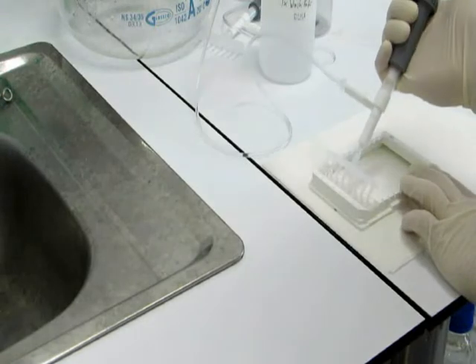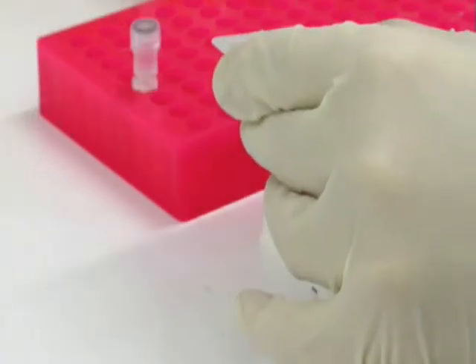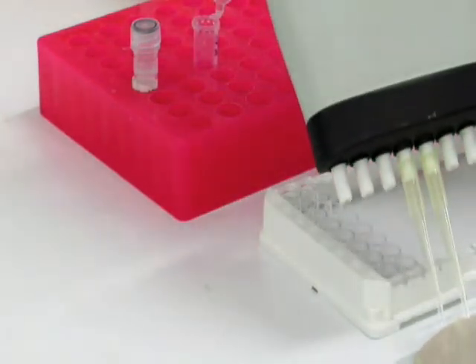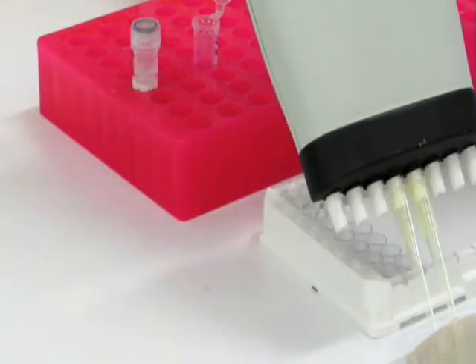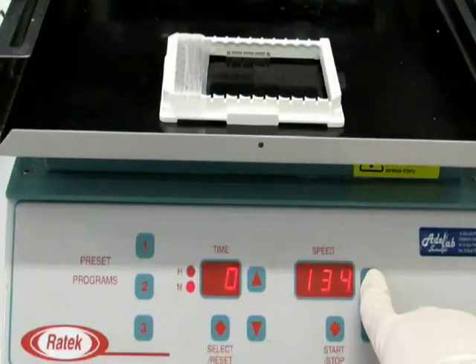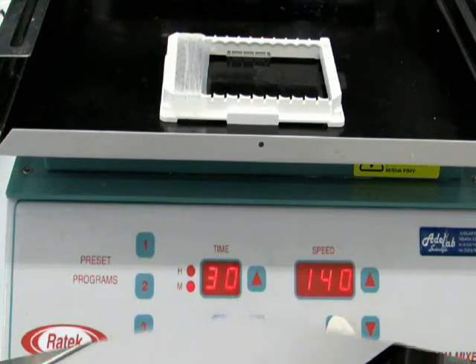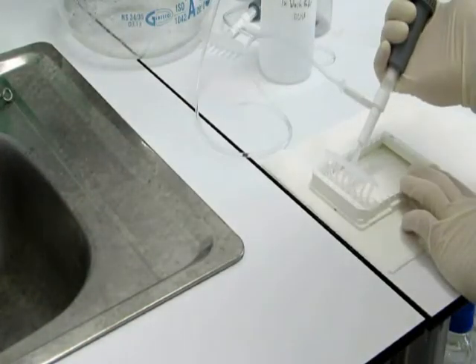Add 100 microliters of streptavidin HRP conjugate to each well. Repeat the washing step. Seal the plate and incubate on a shaker at 100 rpm for the appropriate time, then repeat the washing step.